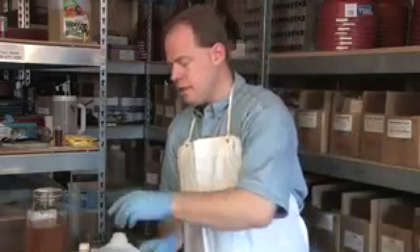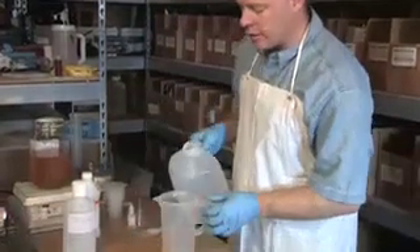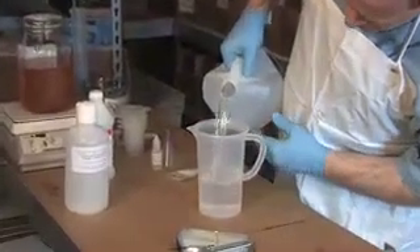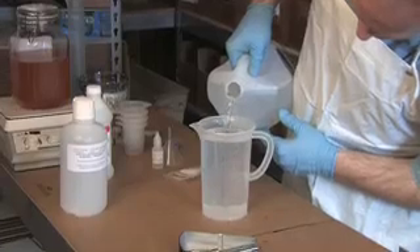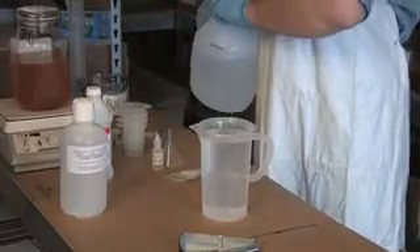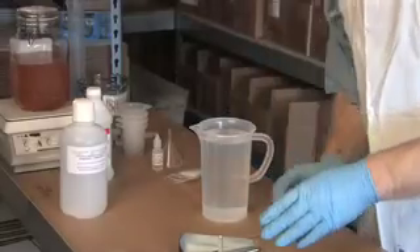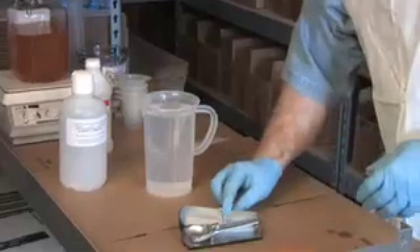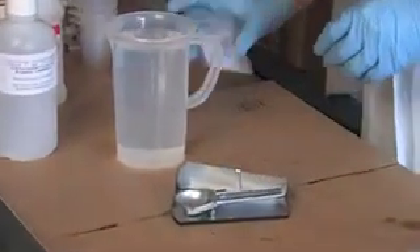First thing we're going to do is take and add a liter of distilled water to a container. There's a liter. Then I'm going to measure out with my very accurate scale one gram of the catalyst I'm going to use when I make biodiesel. My catalyst of choice is potassium hydroxide.